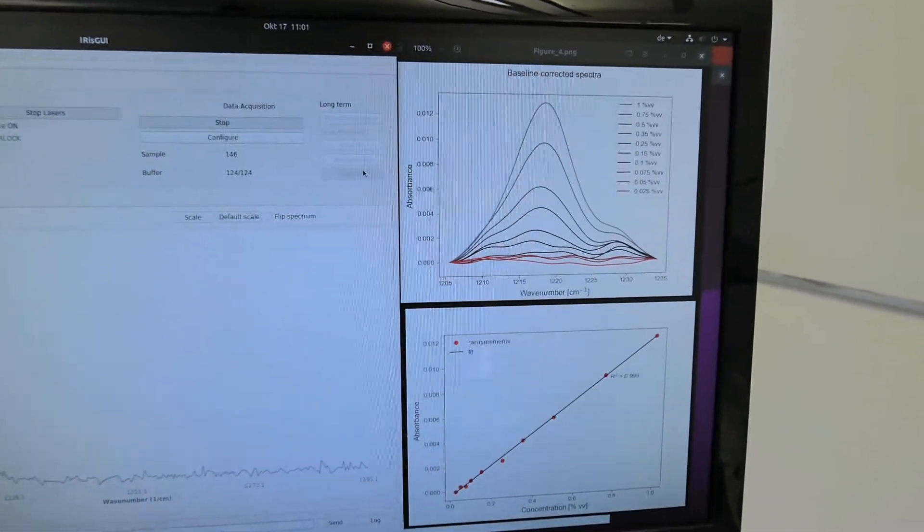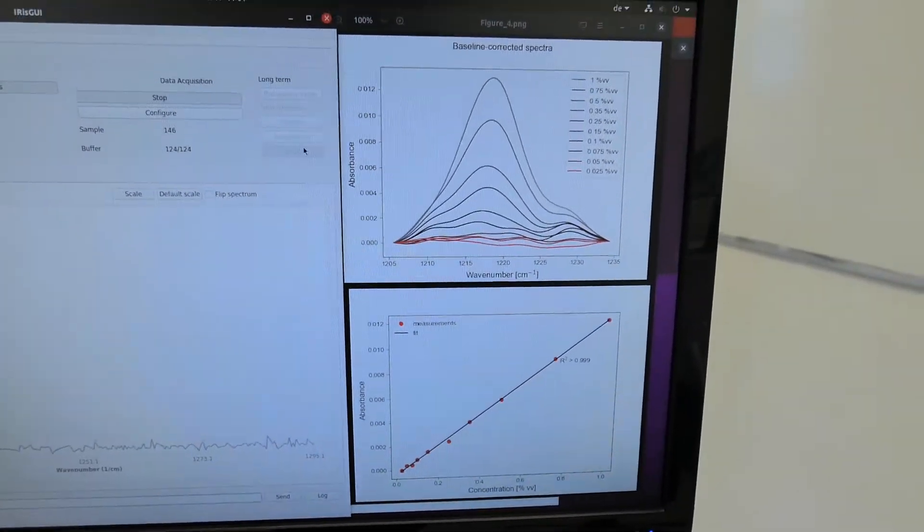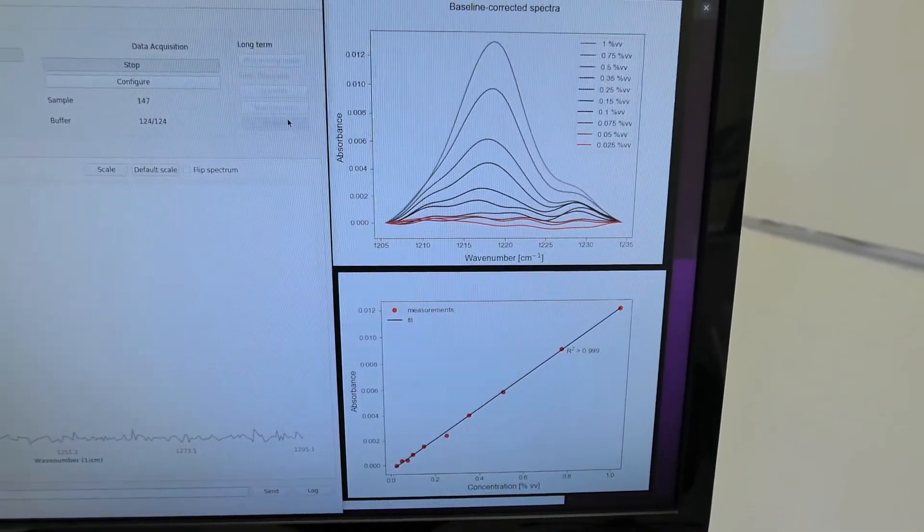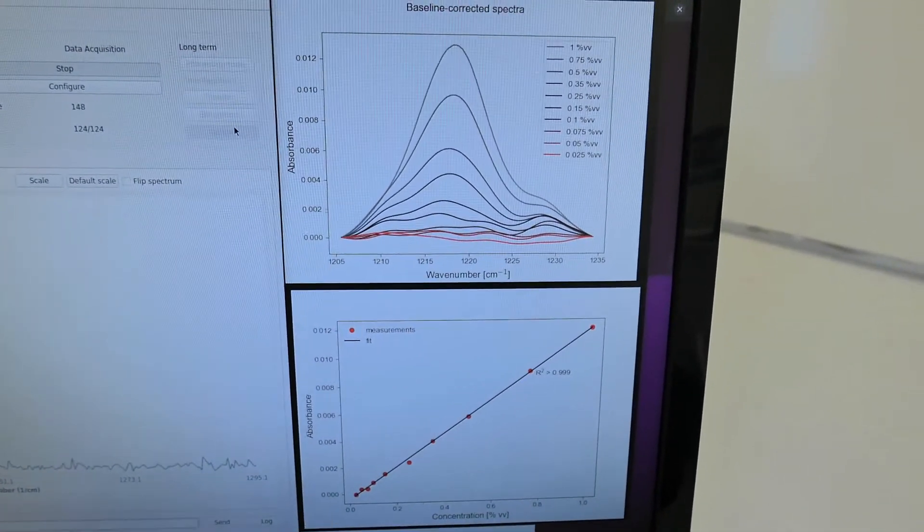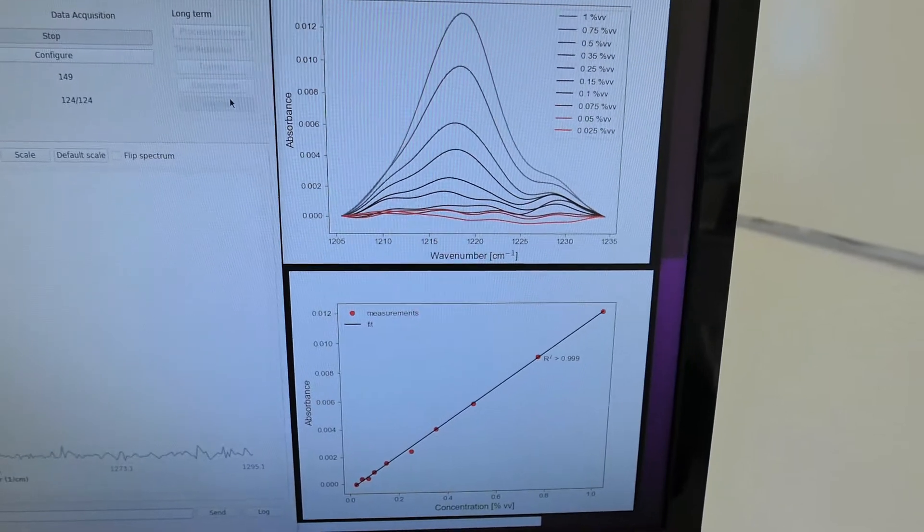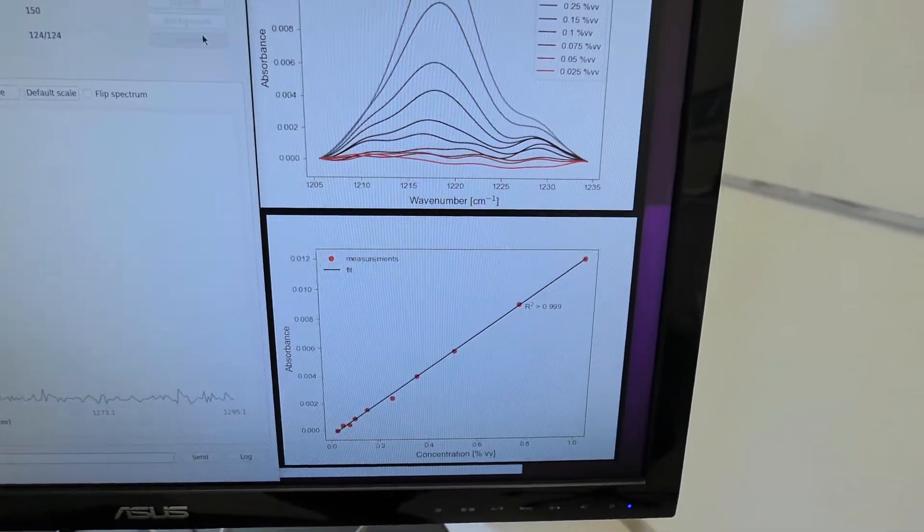And what you can get after a little bit of averaging is shown on the right here. So here are some spectra I recorded earlier. You can get to very low concentrations with quite a linear regression, about 0.1%.